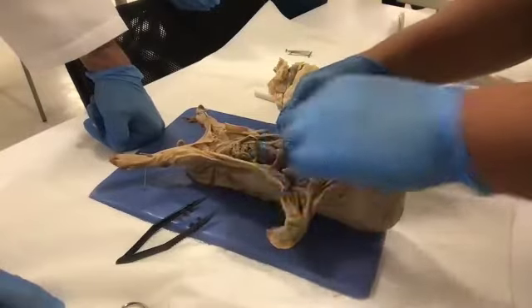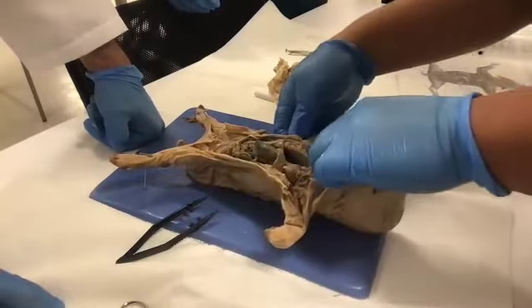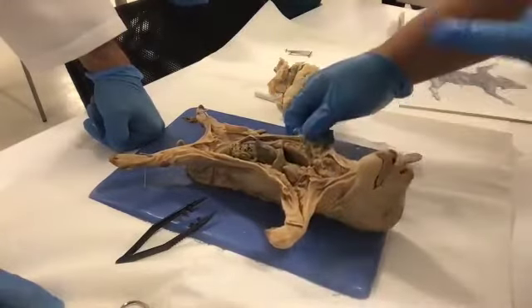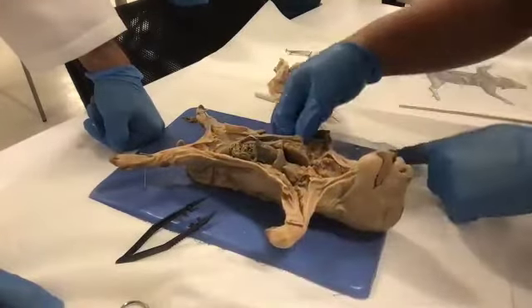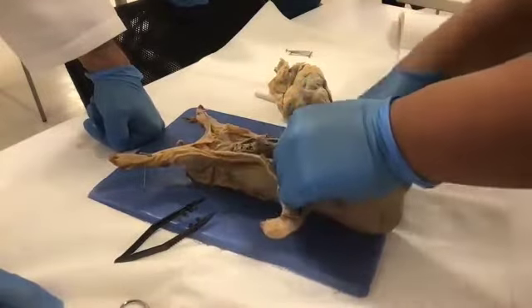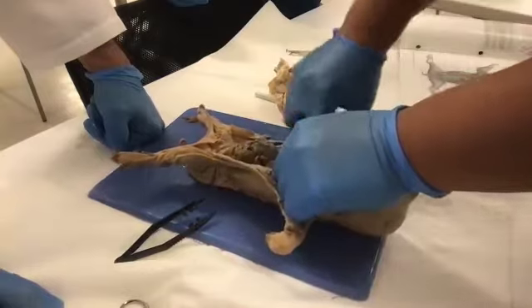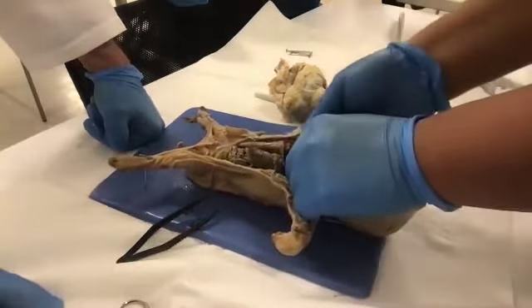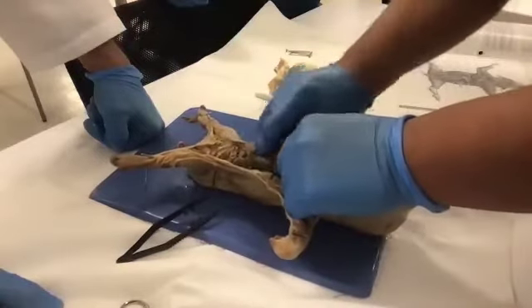And if we start looking at some of the tissue here, here's some of your fascia. See how it's shiny? And look, the outside, I can't rip. But look, with just my finger, I don't even need a scalpel or straight scissors or anything. Look what I can do. I can start ripping everything and opening. See how I separated all this? I didn't even use a knife.